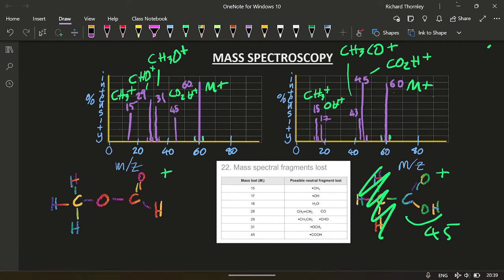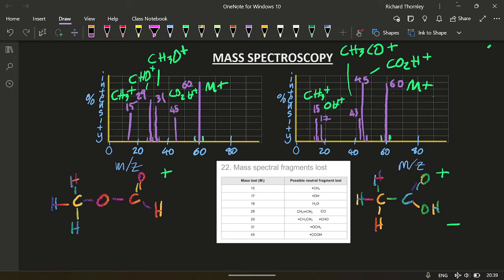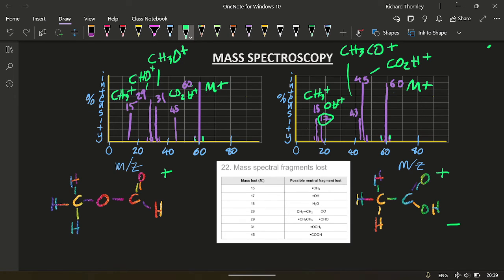Yep. So mass spectroscopy can definitely tell the difference between them. There's some unique peaks here. Essentially, there's 17. Once you see the 17, you know you're dealing with the OH from the carboxylic acid.